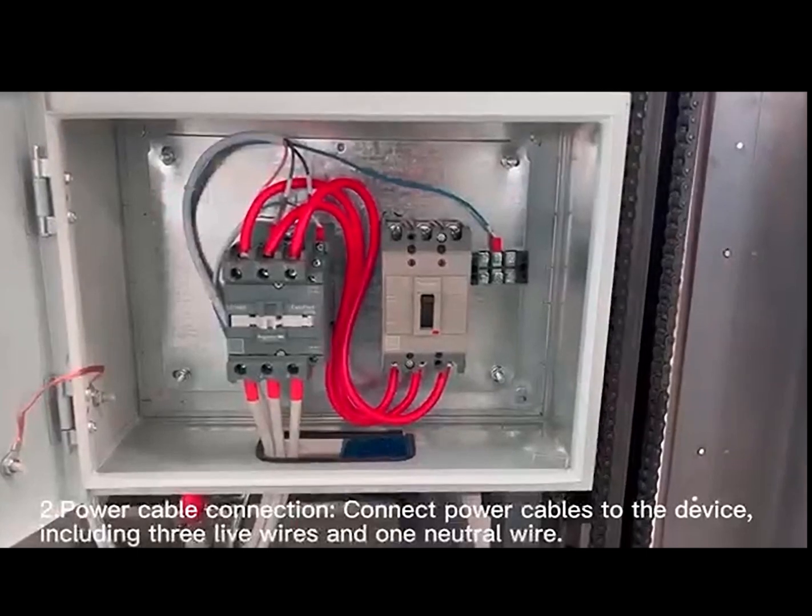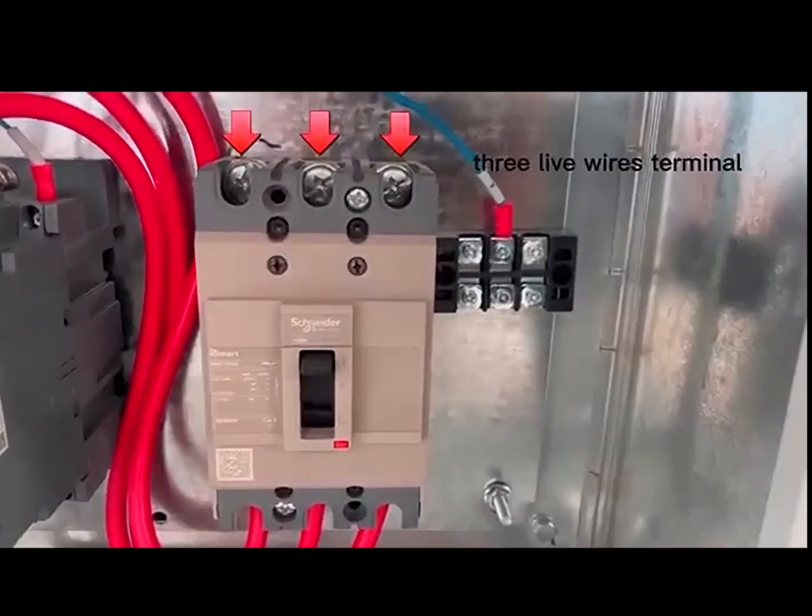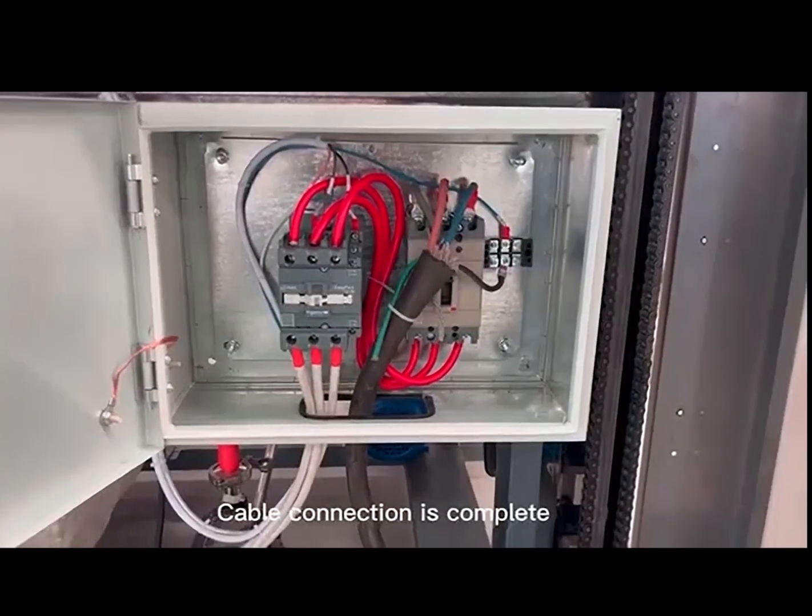Power Cable Connection: Connect power cables to the device, including 3 live wires and 1 neutral wire. Cable connection is complete.